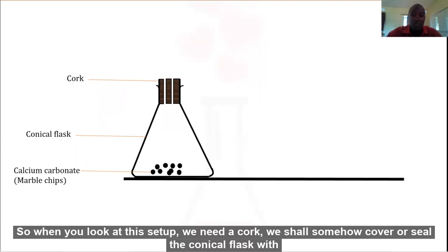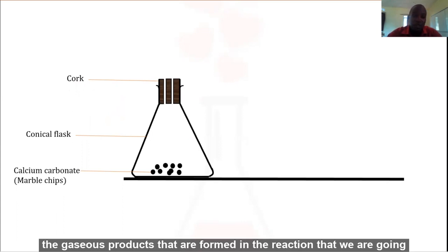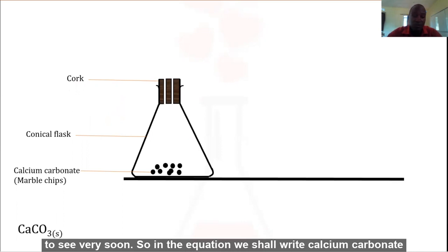When you look at this setup we need a cork. We shall cover or seal the conical flask with the help of a cork because it helps us retain the gaseous products that are formed in the reaction.